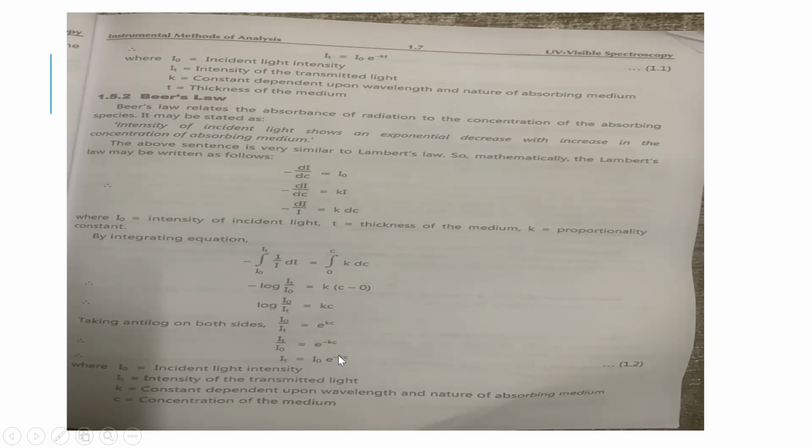So on solving this final form of Beer's law, we get IT is equal to I0 into e to the power minus Kc. On combining these two laws, Beer's law and Lambert's law, we can write this equation: IT is equal to I0 into e to the power minus Kct. So here the final form of Beer-Lambert's law is log I0 by IT is equal to Kct. So here absorbance is log I0 by IT. This formula you have to remember.